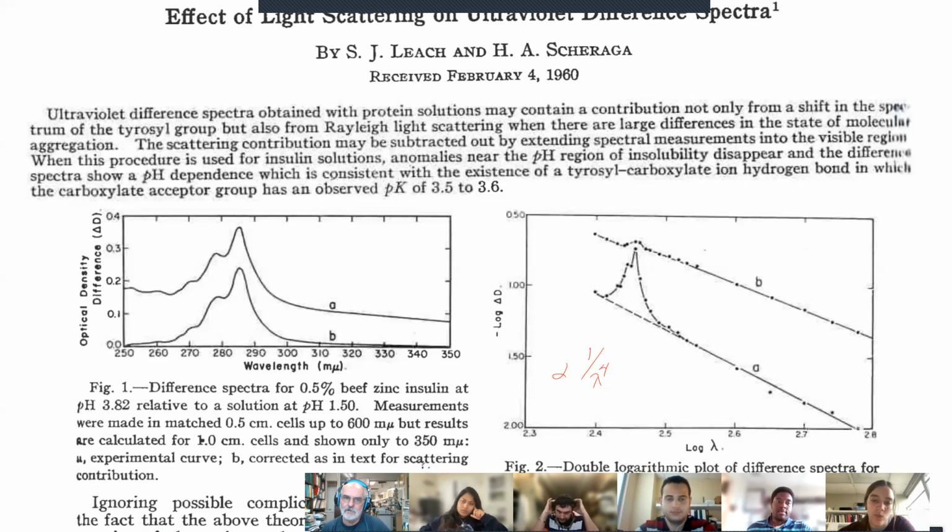The extrapolation was wrong. So I said to her, correct for light scattering. And she said, how do I do that? And I said, Scheraga, 1960. She read the paper, she corrected the data. Now the data went through the buffer density on her ordinate, and she was getting the correct value now, okay? So it's something that happens in certain samples, and it's something you have to correct for.